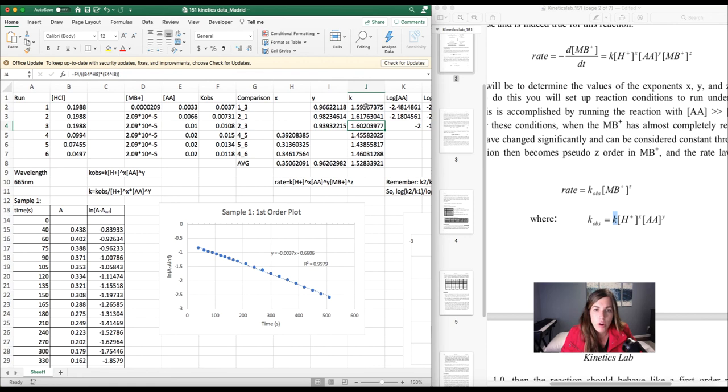Okay, if you do that all the way down, you will get a value for K, and then I also solved for the average for my K right here. So this is my average K, average Y, and average X. So I'm going to highlight this. Go ahead and pause the video to make sure that you can get all of your averages and then calculate your K value. And then come back just to make sure that we have appropriately calculated everything.